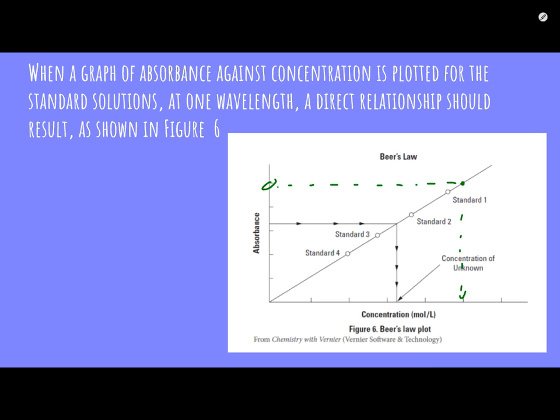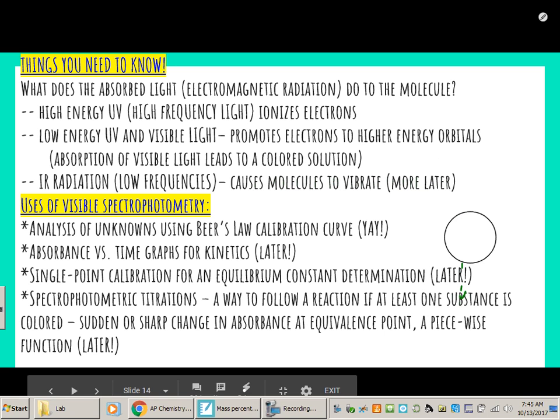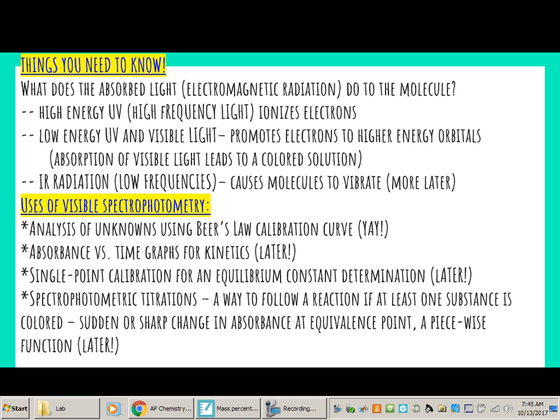Okay, so we have to make our own calibration curve because we don't have this curve already, because we've never done one with copper 2. So this is background information. It's more about the Spec 20s and how to use them. What I actually need to tell you, I'm thinking a lot of this stuff is later on in our AP Chem lives.